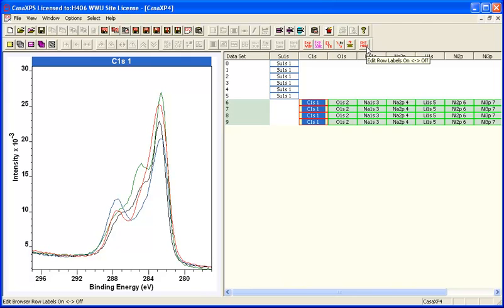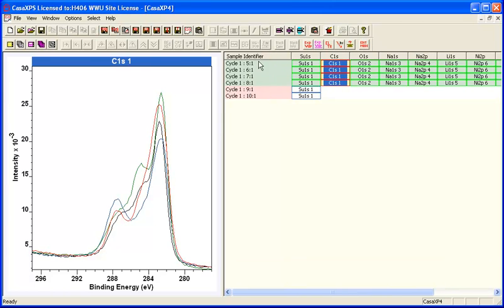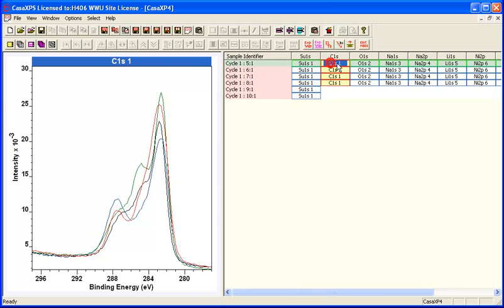If you go to the Edit mode, you can see that the identifier within the data file shows that these survey data go with these high-resolution spectra. There are two survey spectra that don't have high-resolution spectra with them.